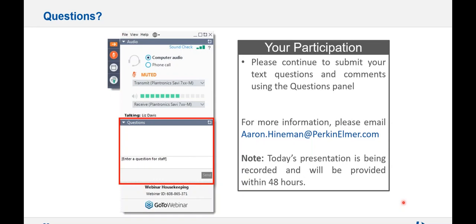And you can call AA Tech Support, or you can send an email to aatechsupport@PerkinElmer.com and ask for those documents that will tell you how to make up the modifier. Of course, as always, whenever I make up a modifier, I make it up on the scale. So that way, keep it clean.